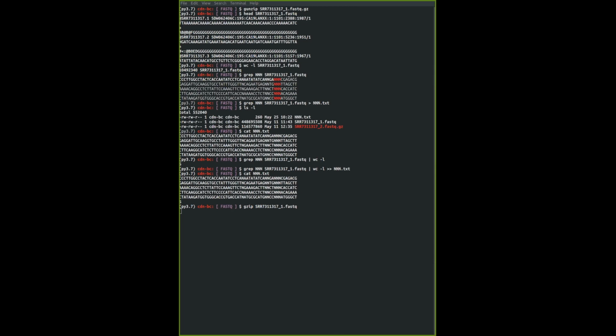So I think last week I should have explained a little bit more on paired-end sequencing. So I'm going to do it right now and recap a little bit on this RNA-seq pipeline before we move on to the first part of the workshop. On Etherpad, there are two links that have been pasted. Click on the first one to have an idea of how a read looks. I'm going to share my screen to make sure that everybody can see what's going on.